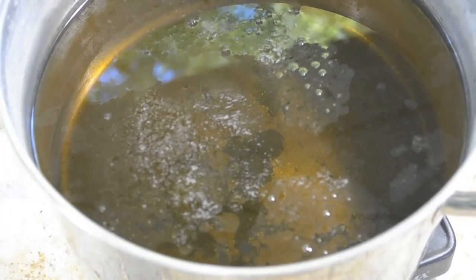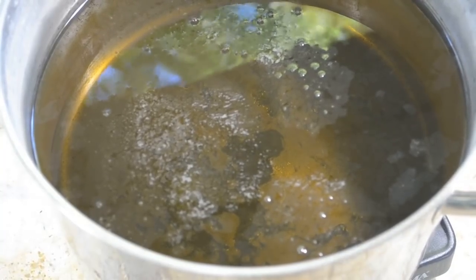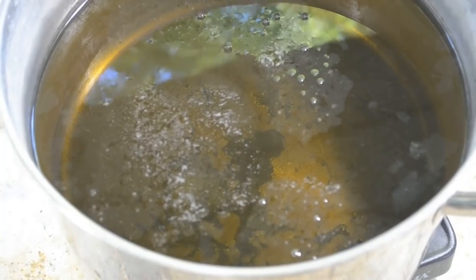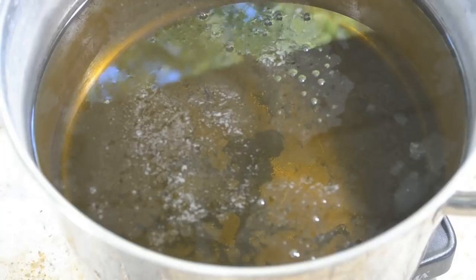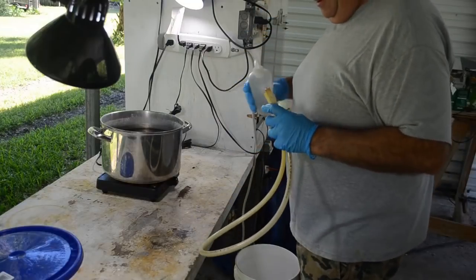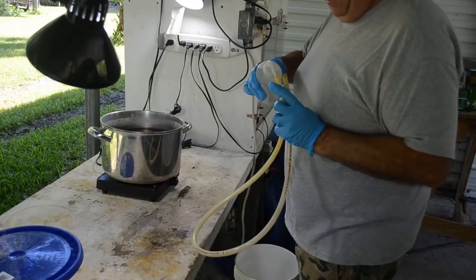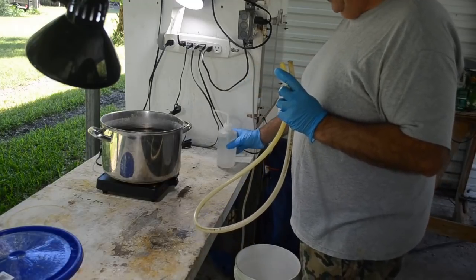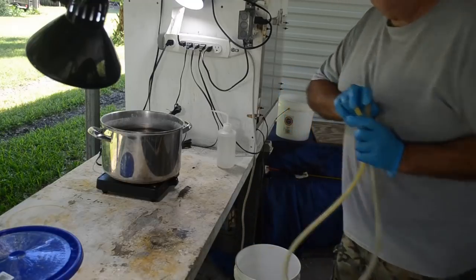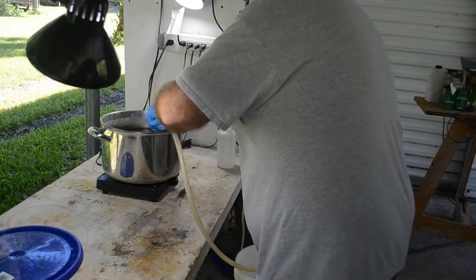All right, so what I'm going to do is something similar to last time. I'm going to siphon the bulk of the liquid off, but I'm not going to bother filtering it. I'm just going to siphon it into a bucket. And then once I get down to the bottom where all the gold is, I will get that into a filter. So let me get set up and we'll get that done. Siphoning again. You've seen this a few times before. Just going to siphon the bulk of this liquid off. Then set up the filtration setup and get the sludge out of the bottom that contains the gold. So I probably won't show too much of this.